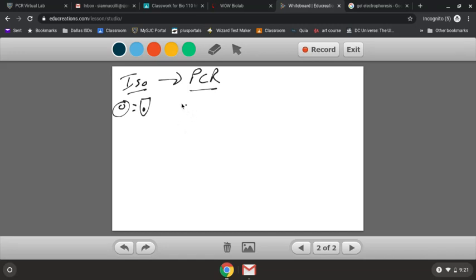So we took one piece of DNA and made it into millions and millions of pieces of DNA, again all in a test tube. So we took one person's DNA and amplified it. Let's say we had 10 to the 5th amount of DNA here, and here we have 10 to the 20th.